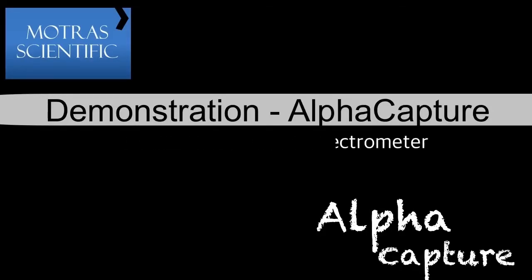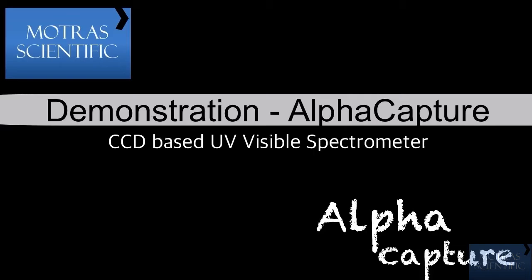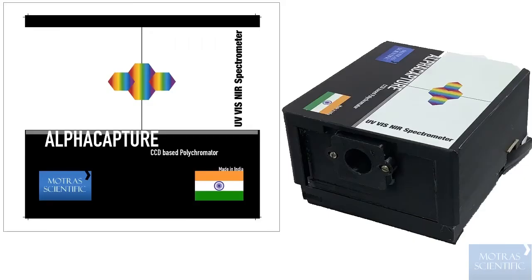Welcome to the demonstration of Alphacapture, the CCD-based polychromator spectrometer. In this video, we will show the application and performance of Alphacapture.